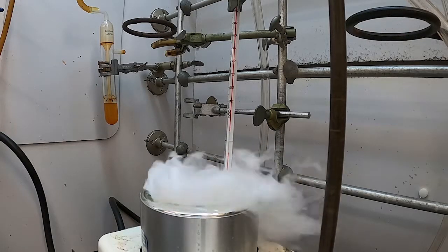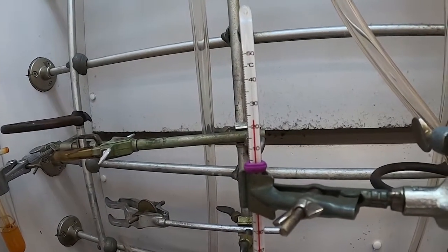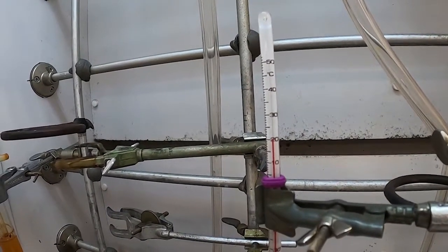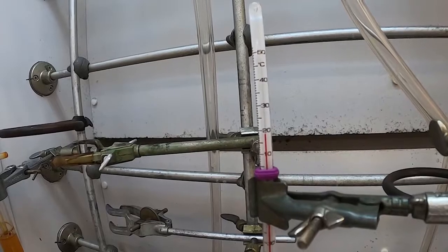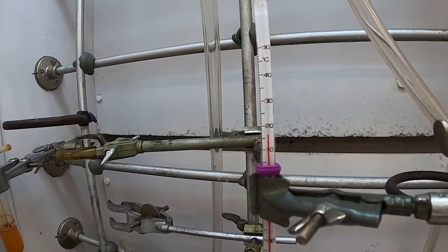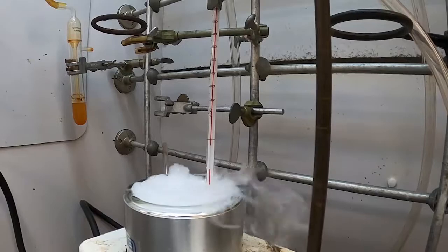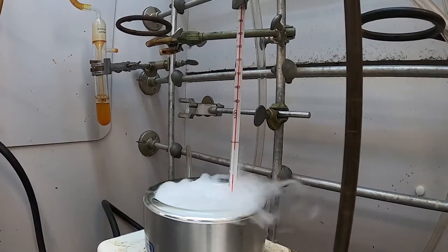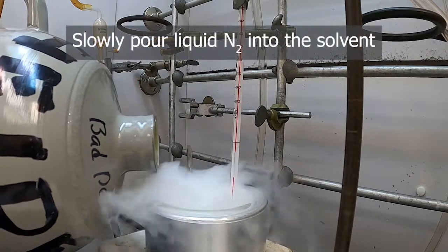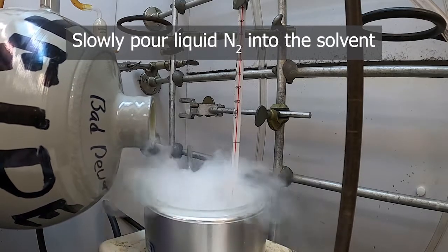And our temperature is dropping. It's up here at this point. We're actually up around 30 degrees, so I do believe that this thermometer does have a bit of an offset. It's not 30 degrees in here. Dropping. Just slowly pour. See if I can catch the stream of nitrogen coming out on the camera.